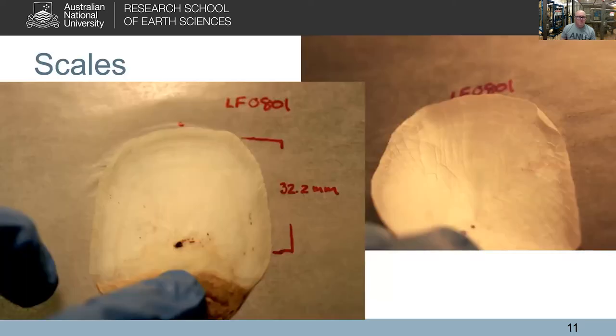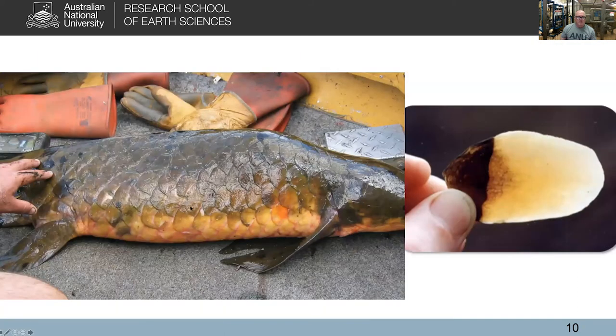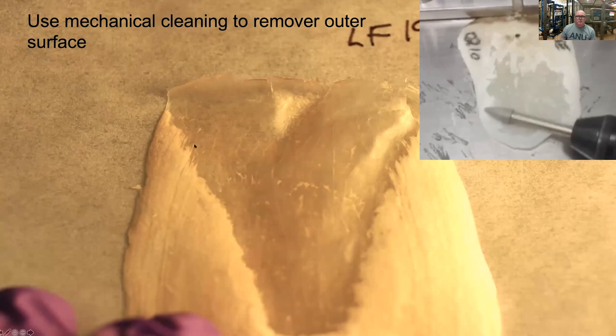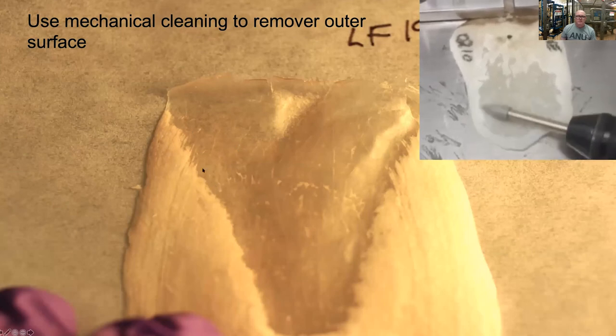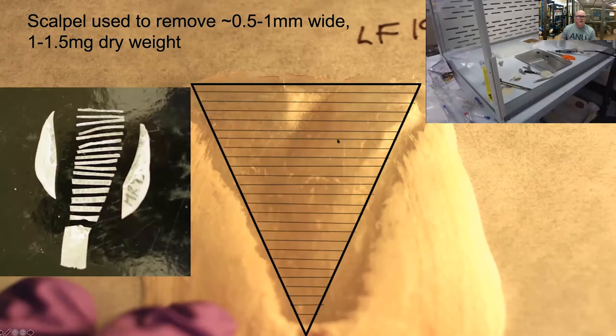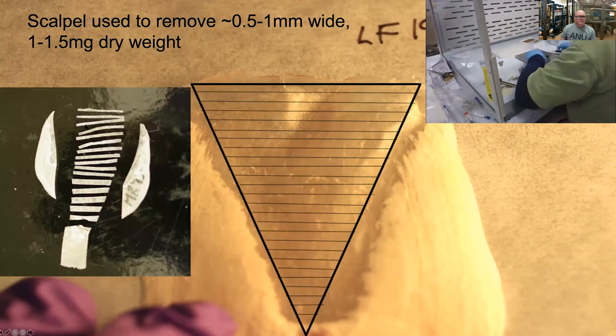So here's just a closer look at some of the scales. The dark part is the part that you see on the outside, that you can actually see on the fish. And the lighter part is the part closest to the skin of the fish. This is the part of the scale that extends and is growing, so it's almost akin to a large fingernail or toenail. Before we can measure the samples, we have to do some pretreatments and mechanical cleaning. We have to remove this outer layer on the scale, so we're left with this translucent material. Then we slice the samples in sequential slices, and they weigh about 1 to 1.5 milligrams, and we do them about every 0.5 millimeters.